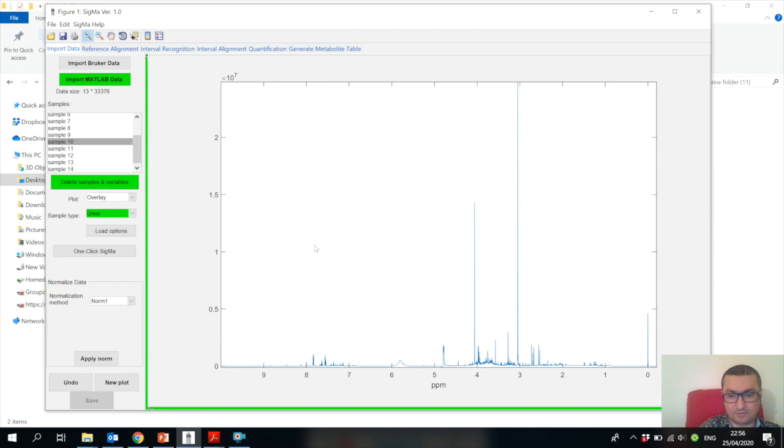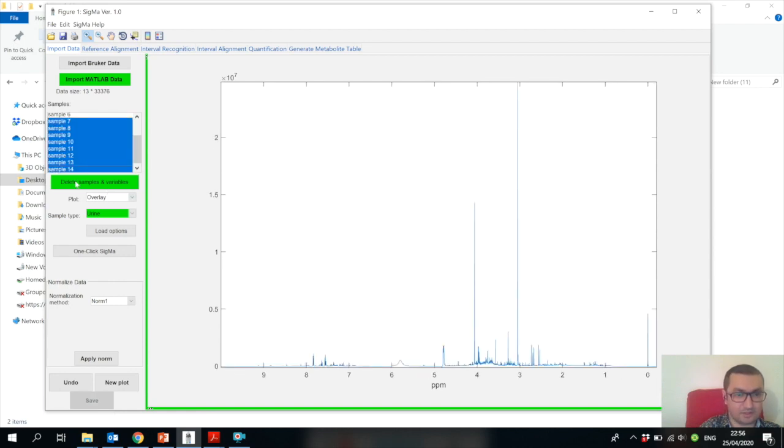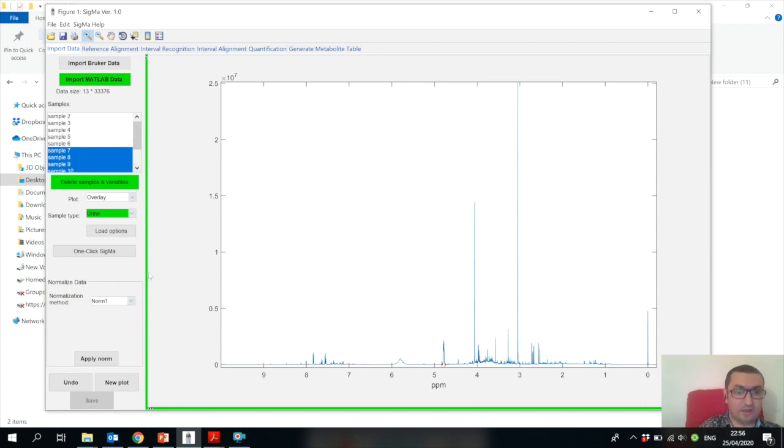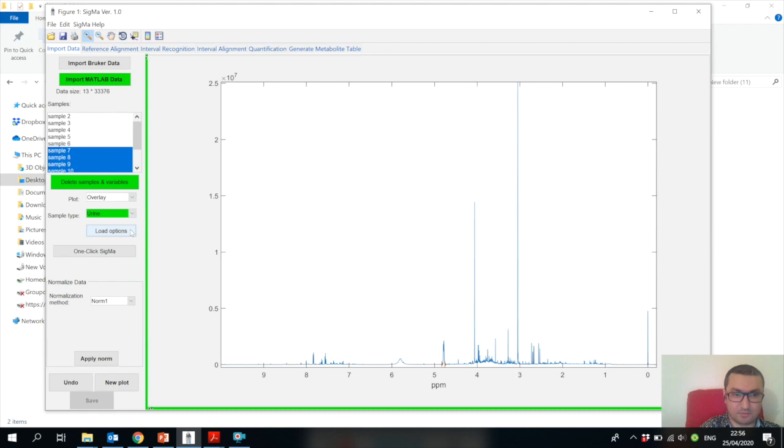You can see that we have New Folder 11 and we have saved the processed data and also the options of Sigma. Now we have this processed spectra where we removed some regions and removed one sample.